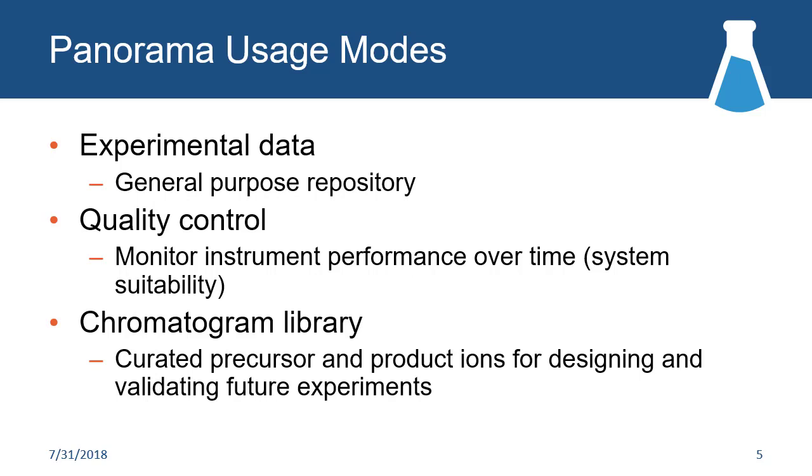The first is the general purpose repository, just a place to put your Skyline files instead of putting them in Dropbox or an FTP server or emailing them around. It's a place that actually knows something about the fact that they are Skyline files, instead of just a generic file that happens to contain Skyline data. It's also a place to track multiple versions of files, or to search over all of that data that you've imported.